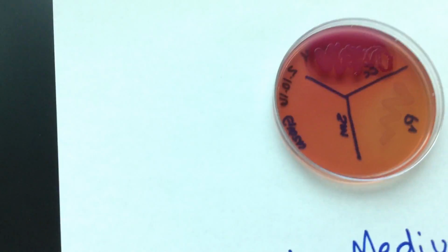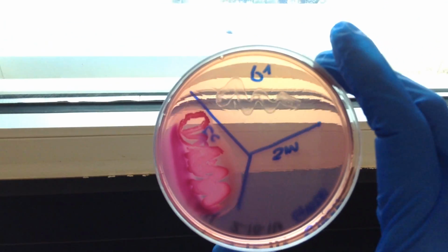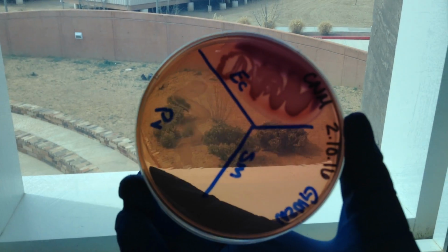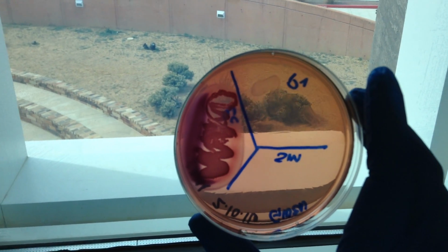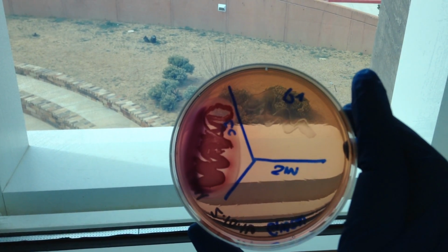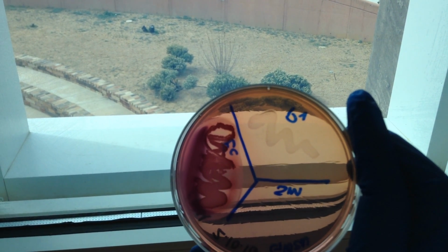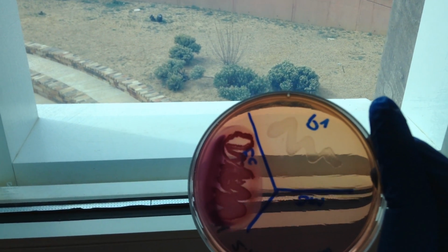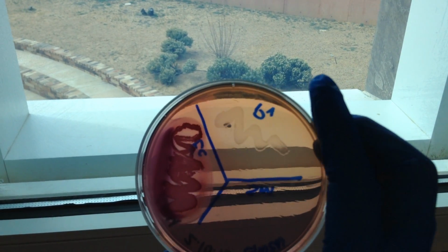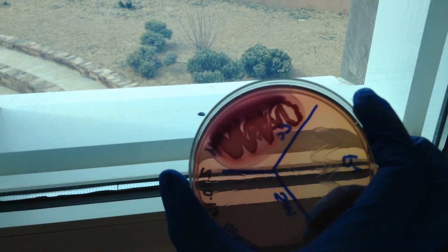So let's compare that to an organism that grows but doesn't have that appearance. And this is our differential aspect here. So now we have an organism that does grow, so it is a gram-negative, but you can see it is clear. You don't see that color change going out into the medium. Now keep in mind that the medium itself has a bit of a tint to it because it's got crystal violet and neutral red, so don't confuse that sort of background color on the medium with the ability to ferment lactose. So here you see no color change out into the medium. It's certainly not that bright pink color. So we say that this organism lacks or doesn't have the enzyme lactase. It is unable to ferment lactose, as opposed to the one we looked at previously with that bright pink color that does have the enzyme lactase and can ferment lactose.